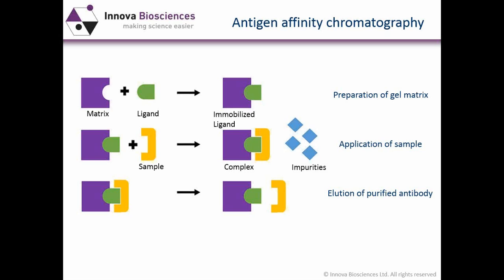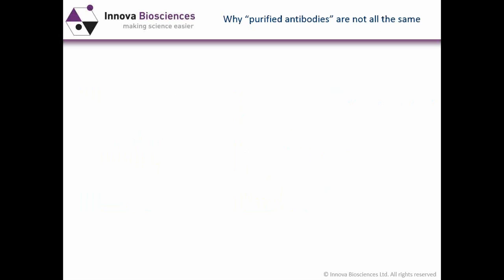So these are just some of the common methods for purifying antibodies. And as I've alluded to during a couple of the slides, there are some things that you need to understand about the differences between these techniques. I'm just going to talk about a few of these now with a few slides that I've entitled "Why Purified Antibodies Are Not All the Same."